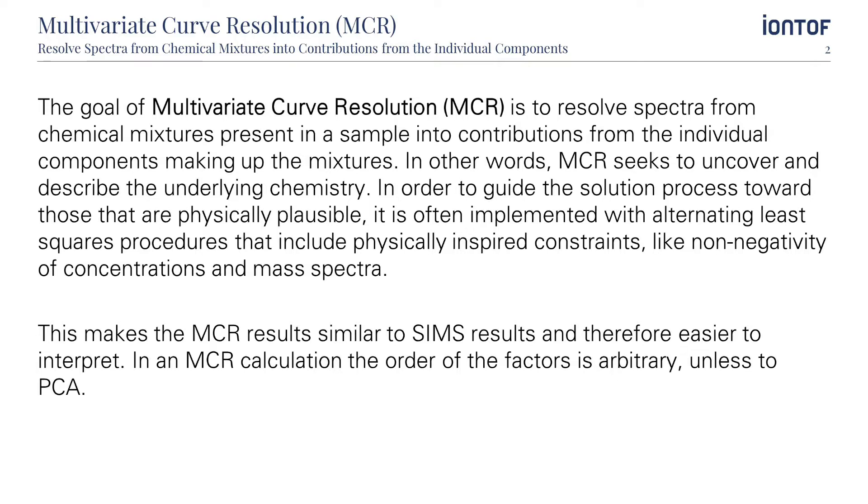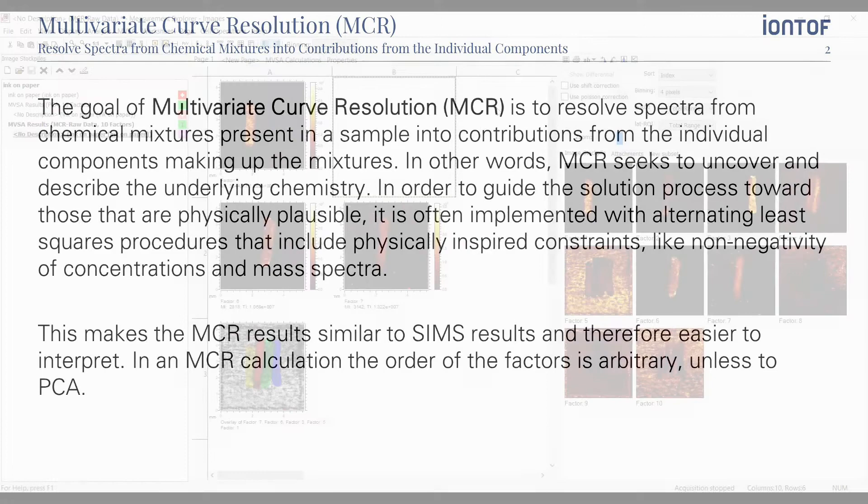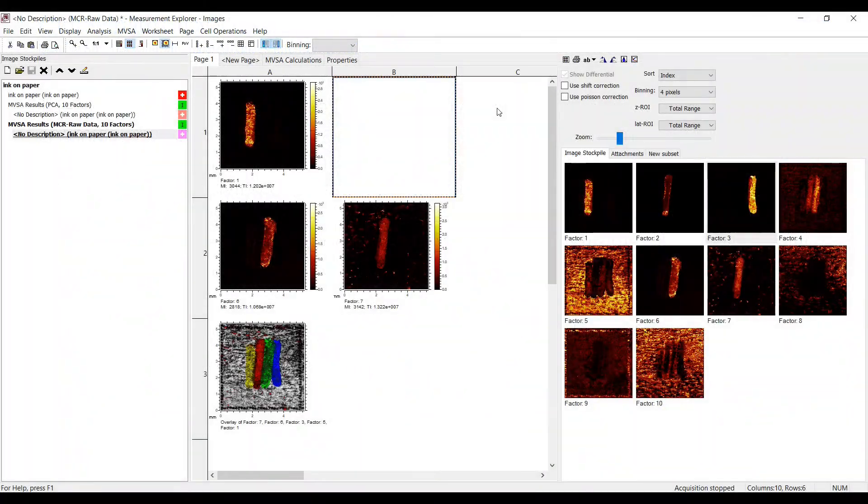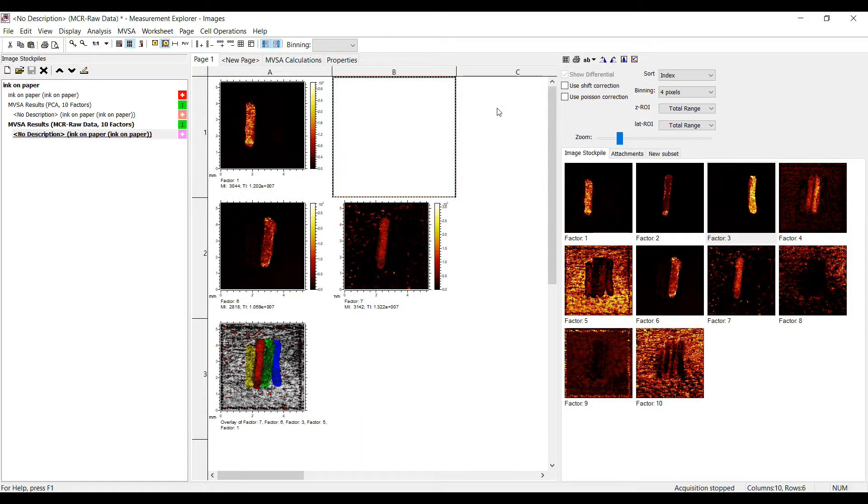This makes the MCR results similar to SIMS results and therefore easier to interpret. In an MCR calculation, the order of the factors is arbitrary, unless to PCA. Please watch our MVSA part 1 video in order to see how to perform the MCR calculation. In this video we will look at the results.